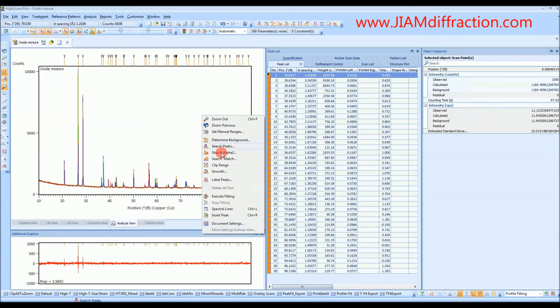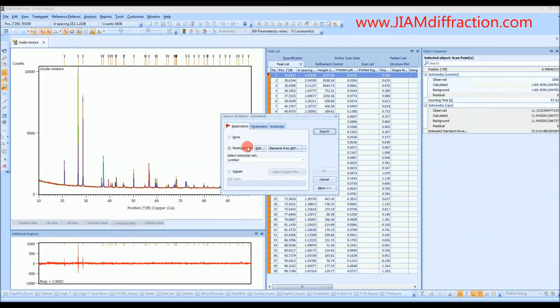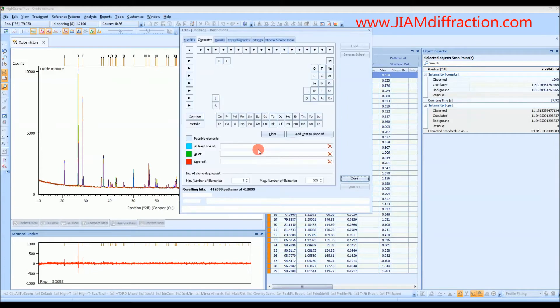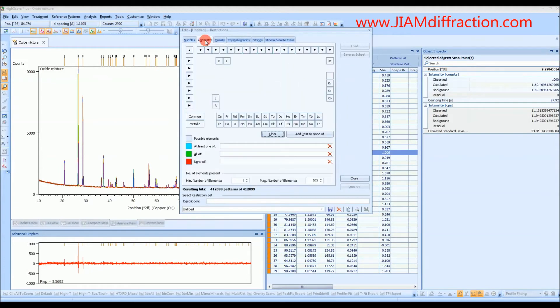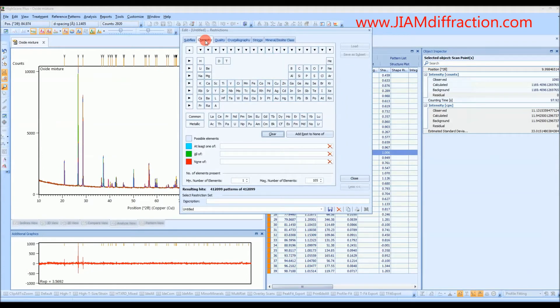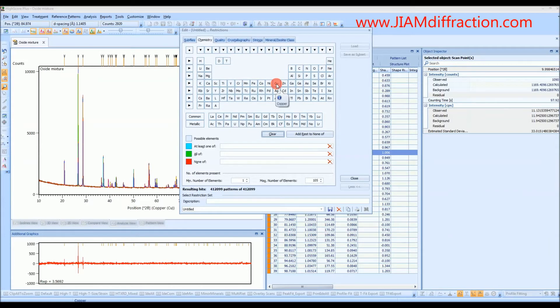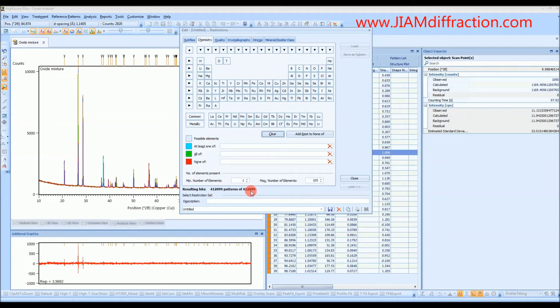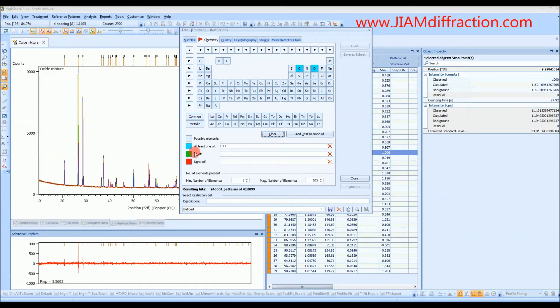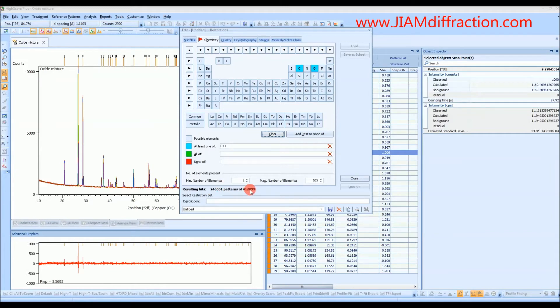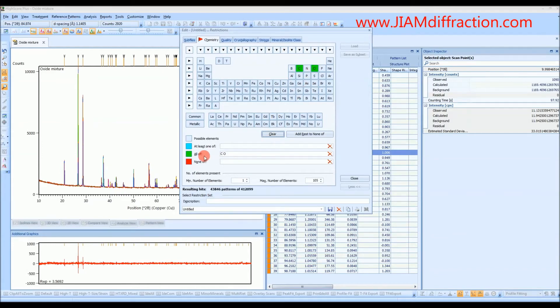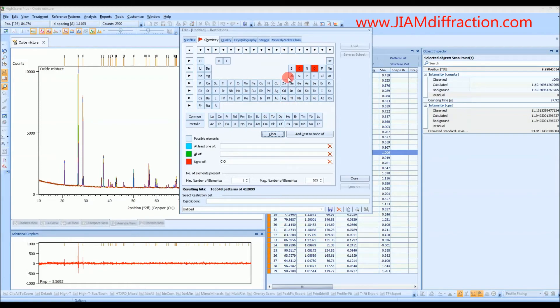So if we right-click we can go to search match and then we want to edit a restriction set. Most of the time I just use this chemistry tab. And here we can tell it what elements we believe we have in our material and to ignore all other elements. For instance when everything is gray like this it means that everything is possible. So we are searching through every possible pattern. If we start clicking some, one click brings us to this bluish color. So that means only patterns that have at least carbon and or oxygen have to be searched. So that reduces it by quite a bit. If we make them green then we will only search through patterns that have both carbon and oxygen. If we made them red then we would search through all patterns except for those containing carbon and oxygen.